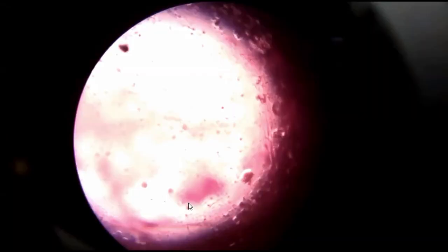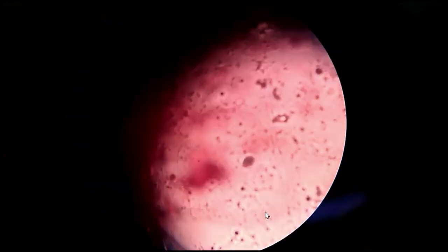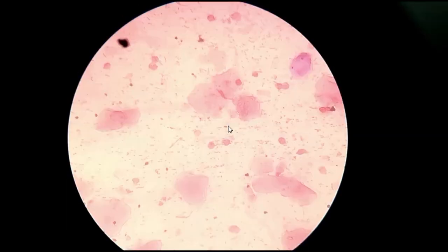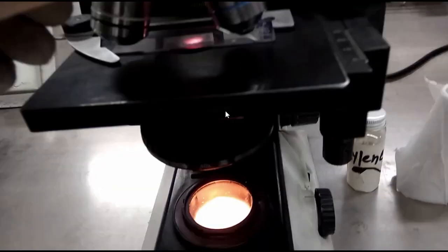Now about fine adjustment. It is carried out when fine focusing is required by using 40x objectives or oil immersion objectives. Here you can see the objective lens is shifted to 40x. So here you can see, by using fine adjustment the image is clear, isn't it?